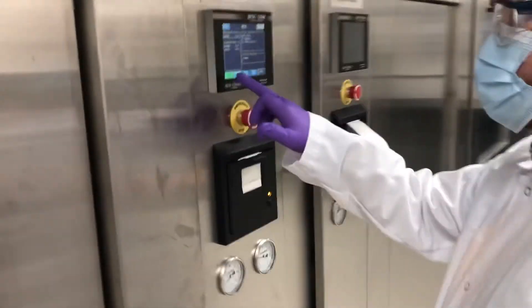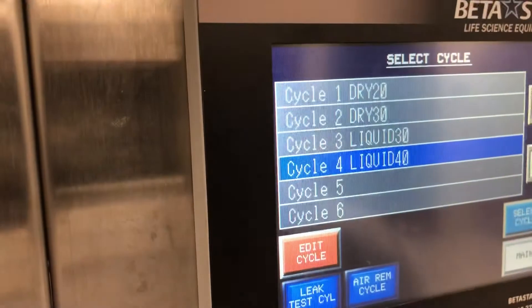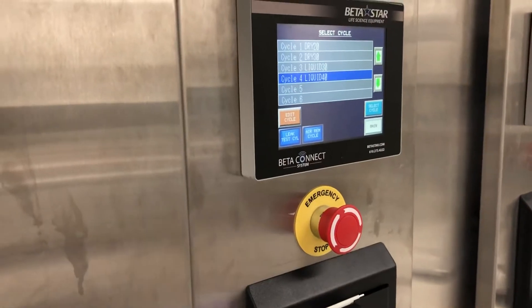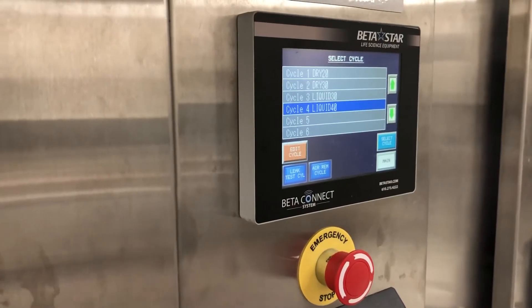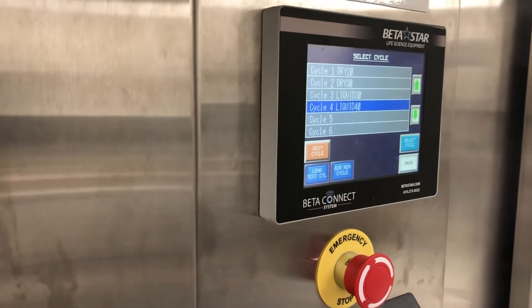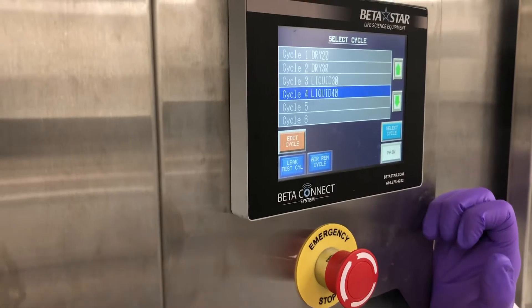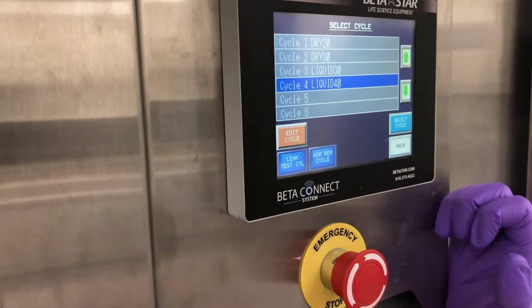Start cycle or select? It is programmed to Liquid 4D, which is what we want, but let's go through the select cycle process so everybody sees that too. This is Liquid 40 — that's the recommended cycle. If you're in a rush, you could try Liquid 30, but we're not in a rush and these plates will not have any antibiotics, so it's important to use Liquid 40. If you're going to add a lot of antibiotics, like we do for mutant DNA, then Liquid 30 would probably be just fine.